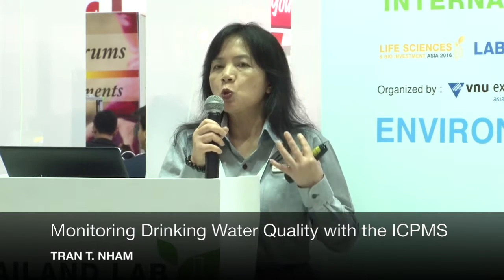Right. Since drinking water is so important to our health, different country authorities set out guidelines to make sure that the elemental contaminants are within a certain limit. If outside the limit, if you drink the contaminated water, it will affect our health, right? Of course, the World Health Organization, WHO, sets out guidelines. Guideline means that I recommend, this is the specification. It doesn't mean that you must follow it, but most countries follow the WHO and modify it for their country's specific conditions.